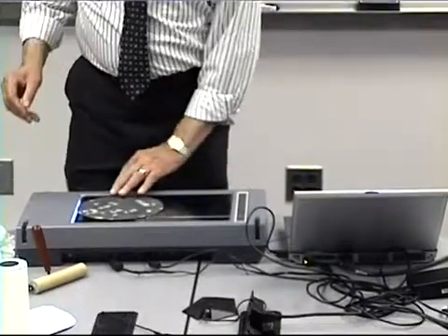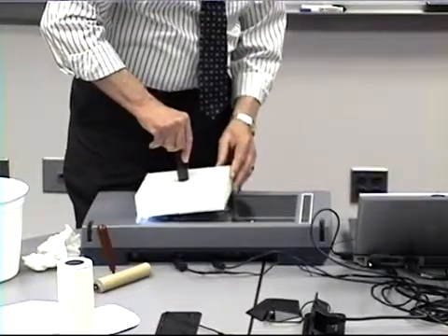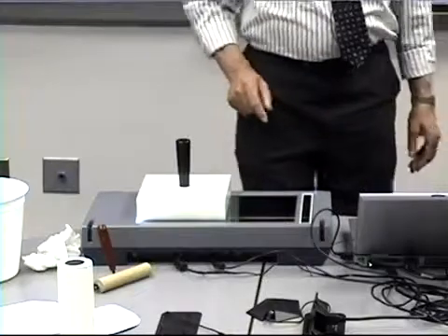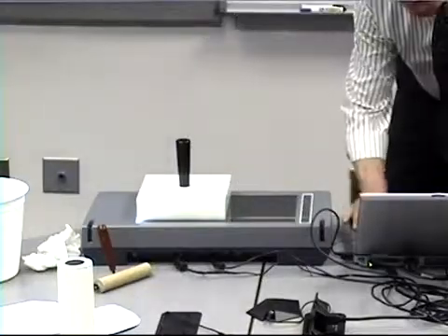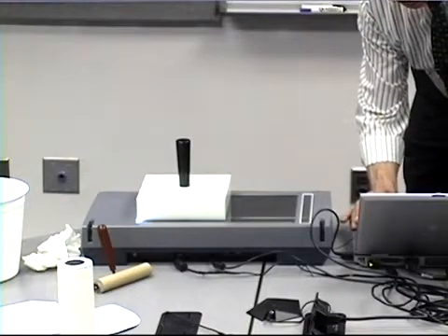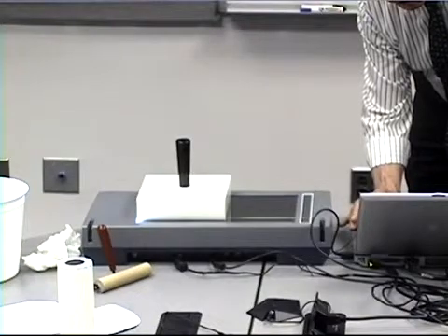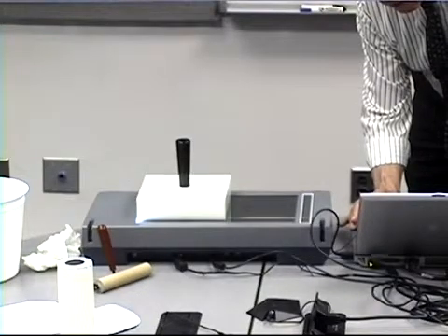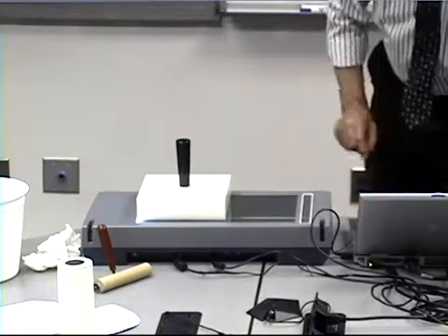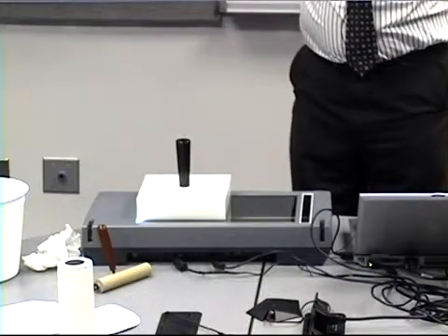I will simulate the test. I have already acquired an image, and I will use it. This requires not using a dirt counter, but to use a more sophisticated program, paper and print quality, one that is able to acquire the image as the dirt counter did, exactly the same way.